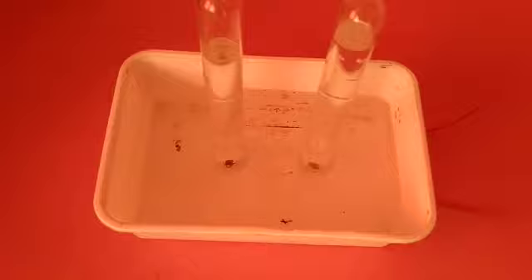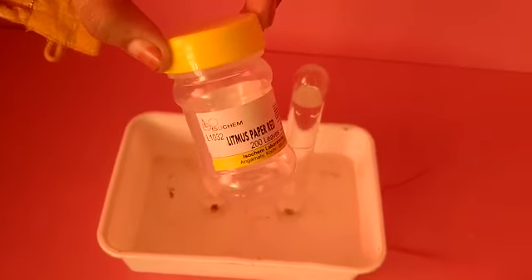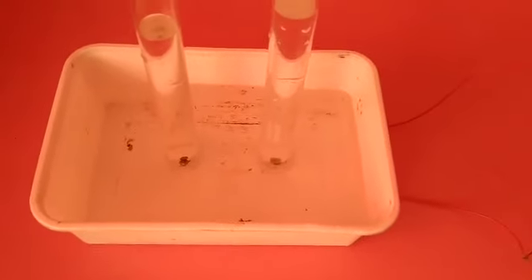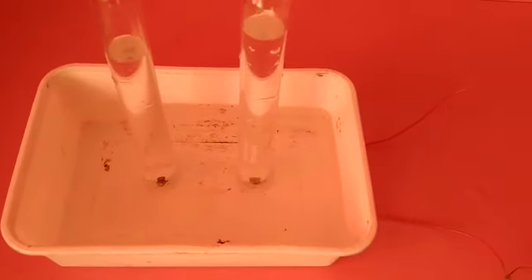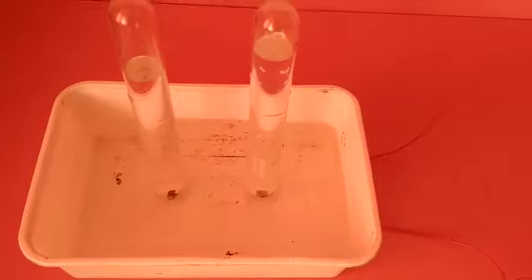Since this pure water is a poor conductor of electricity, we add some sulphuric acid inside the water and it creates free ions inside the water, and now the water conducts electricity.